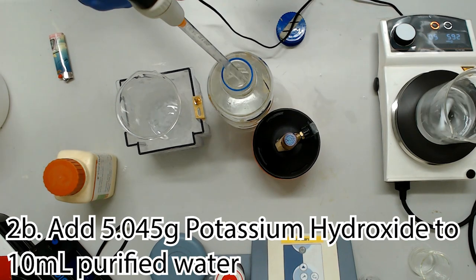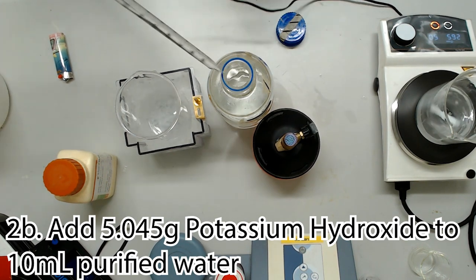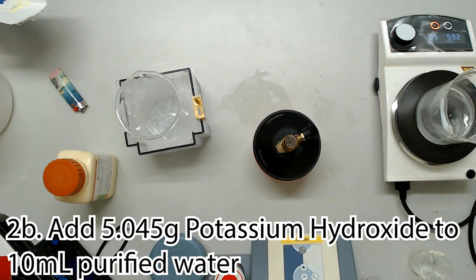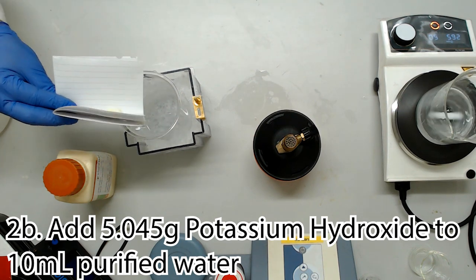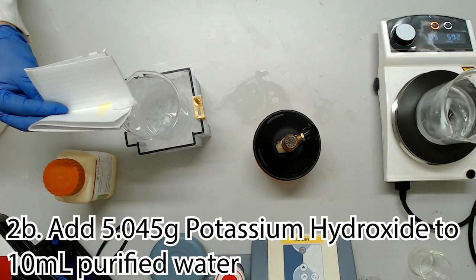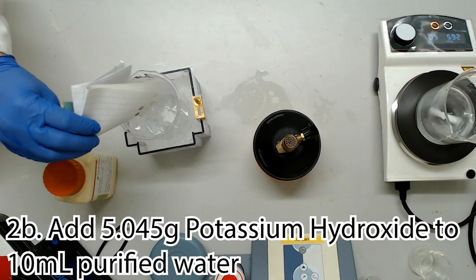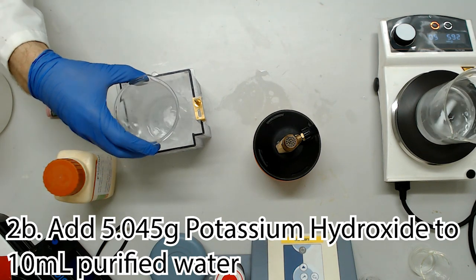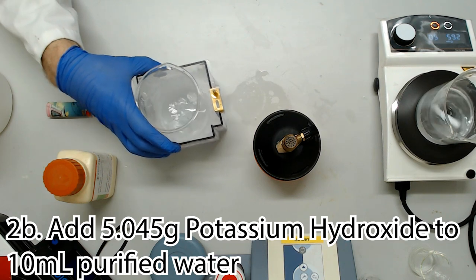Switching from endothermic right onto the exothermic reaction, I'd recommend you find a nice ice box to submerge your beaker containing 10mls of purified sterile water. Add 5.045 grams of potassium hydroxide very slowly. If you chuck it in all at once, it'll make a terrible hissing noise, and I've heard it might catch fire. Needless to say, a patient scientist is a safe scientist. The ice will help speed up the dissolution, but is not strictly necessary, so feel free to give it a cautious stir with a well-gloved hand once everything is settled down.